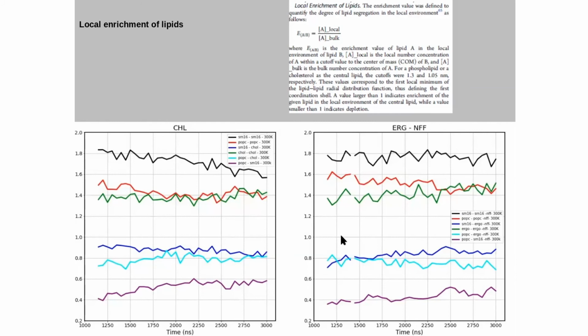But we have this big problem that we don't get the reproduction of a large difference in width between the sphingomyelin and POPC produced by the sterols.